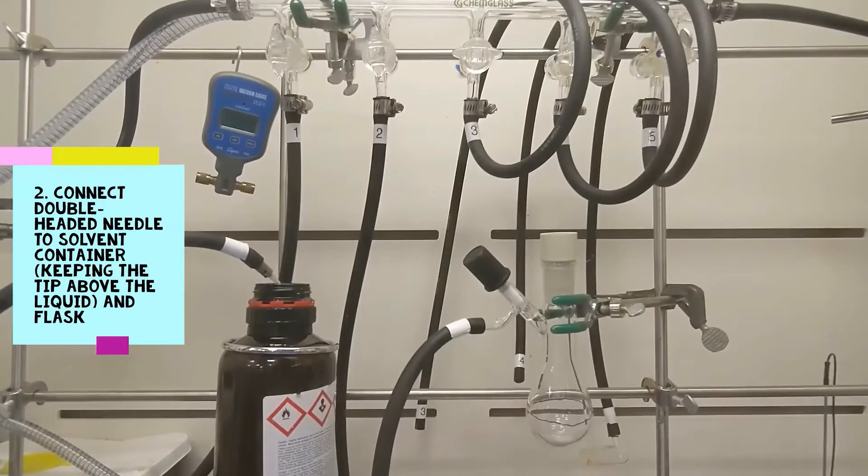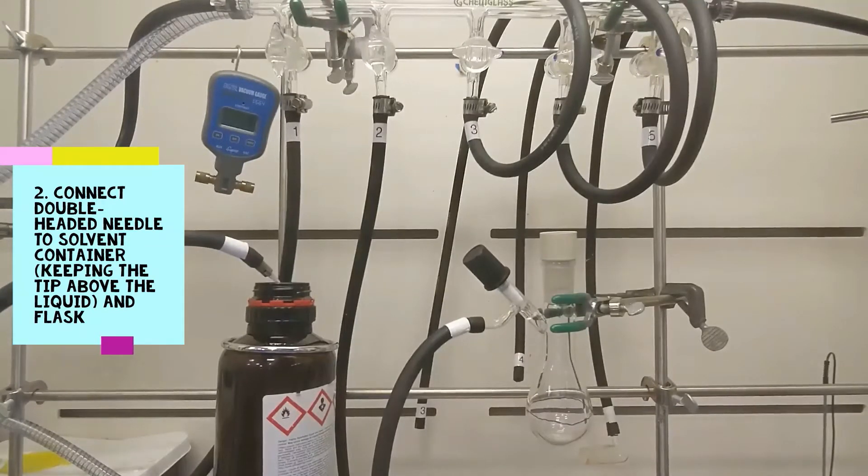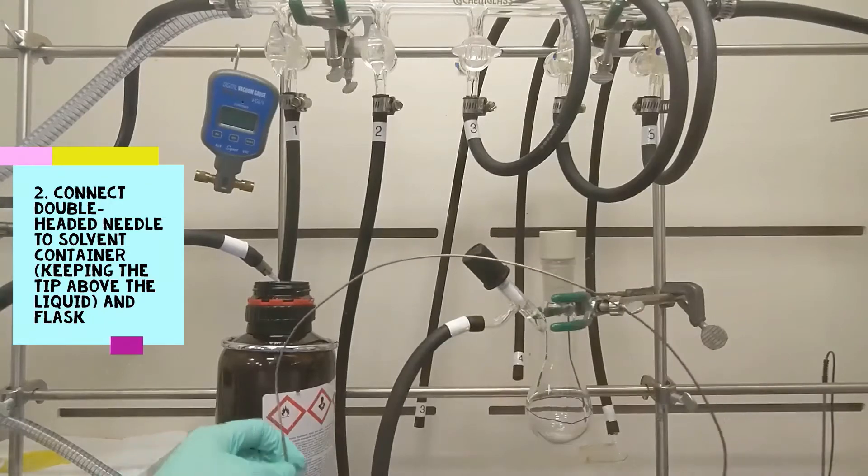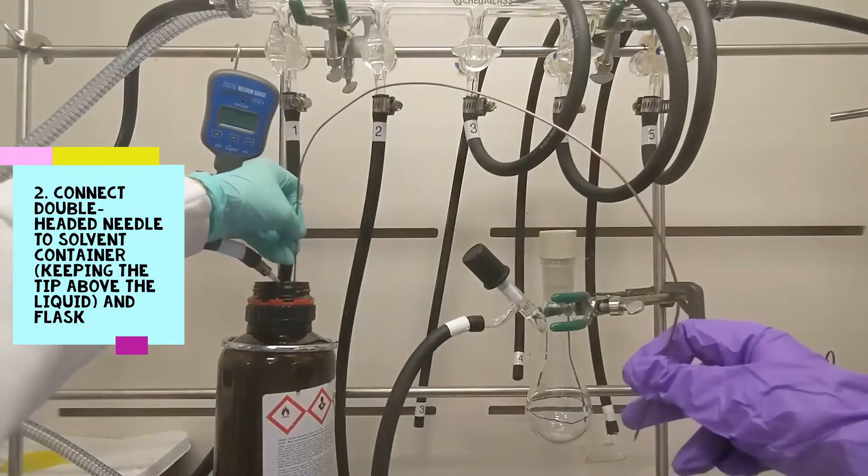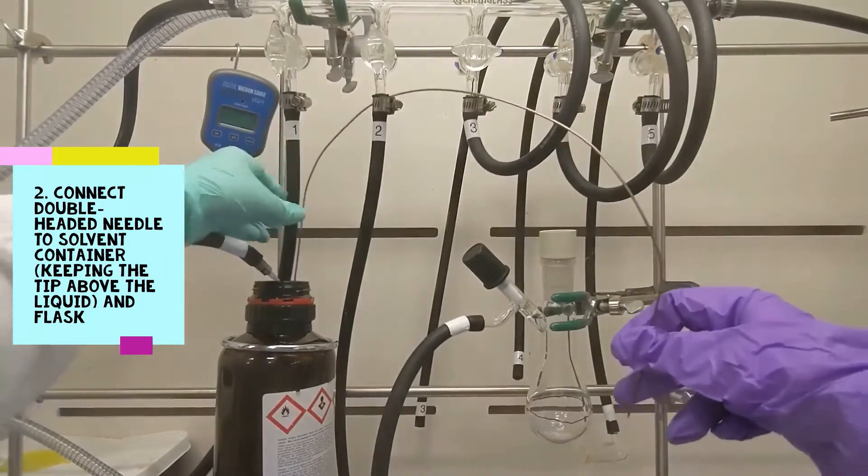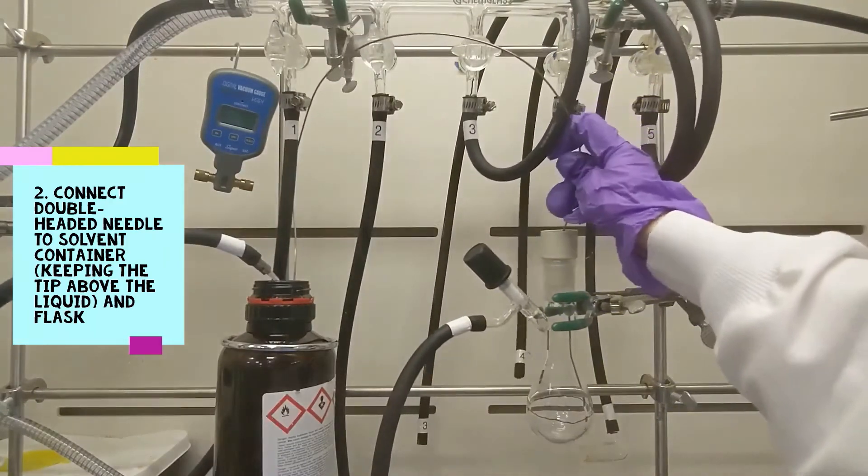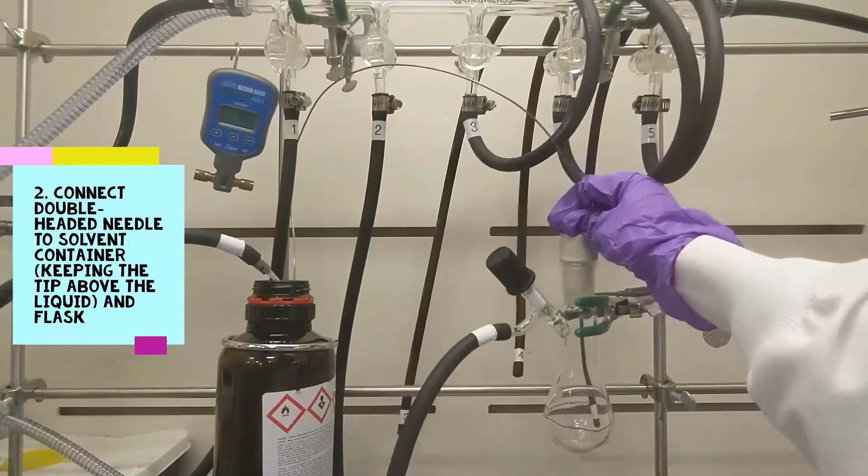Step two, take a double-headed needle and push one side into the septum of your solvents container and connect the other side to your flask. Keep the tip in your solvent container just above the liquid surface right in the nitrogen region. Do not push the needle into the solvents just yet.